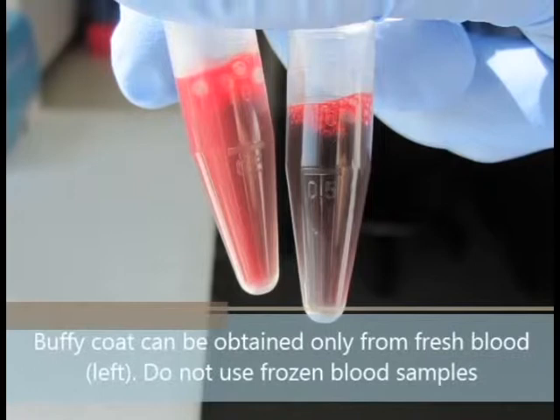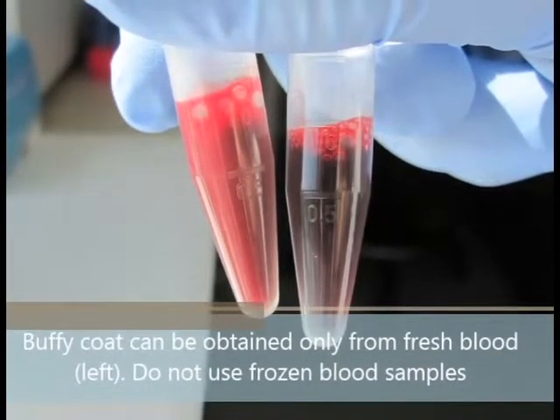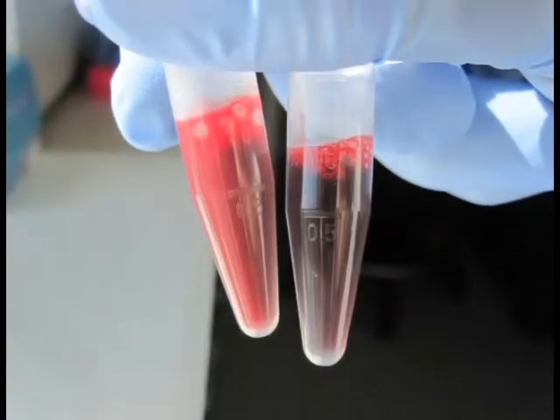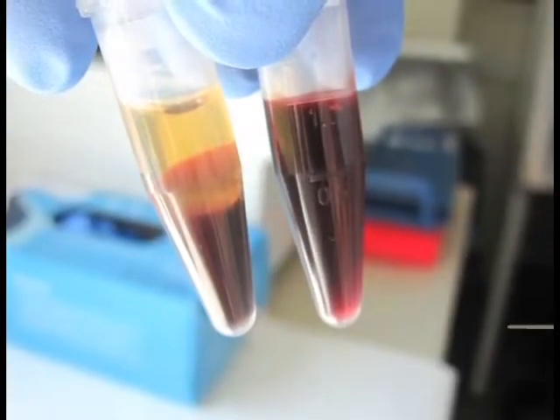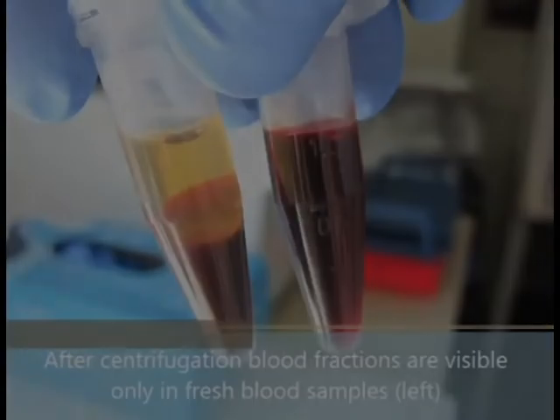First, the Buffy coat must be obtained from fresh blood, shown on the left. Please do not use frozen blood samples, shown on the right. After centrifugation, the blood fractions are visible in fresh blood samples and not visible in frozen blood samples.